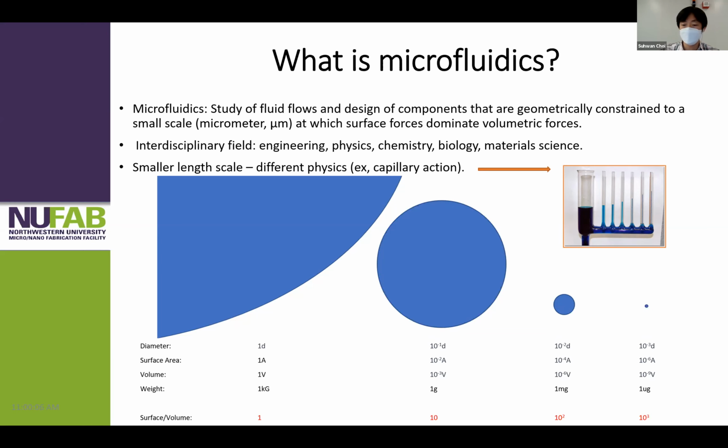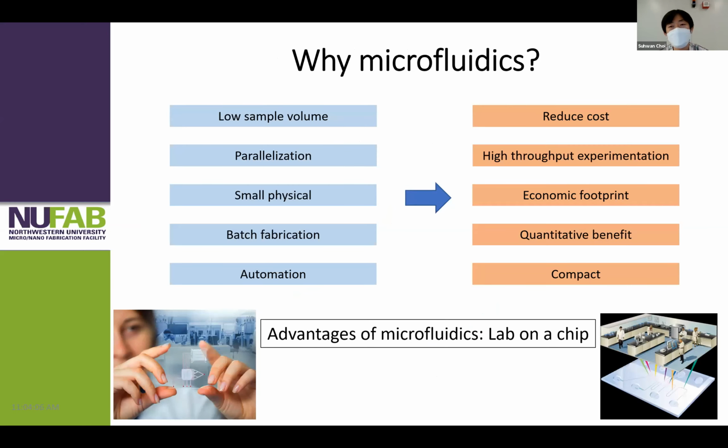Why microfluidics? It requires low sample volume, so we can reduce the cost. Through parallelization, we get high-throughput experimentation, and the small physical size gives us an economic footprint.